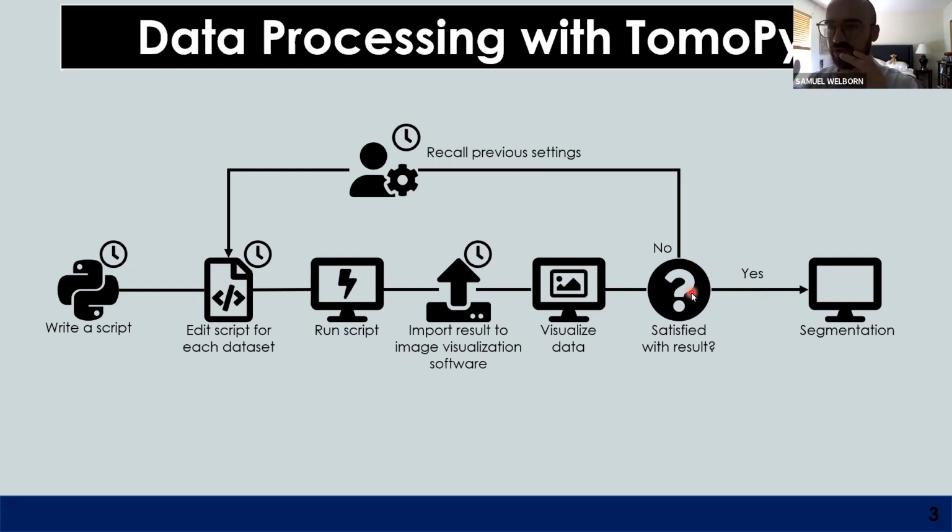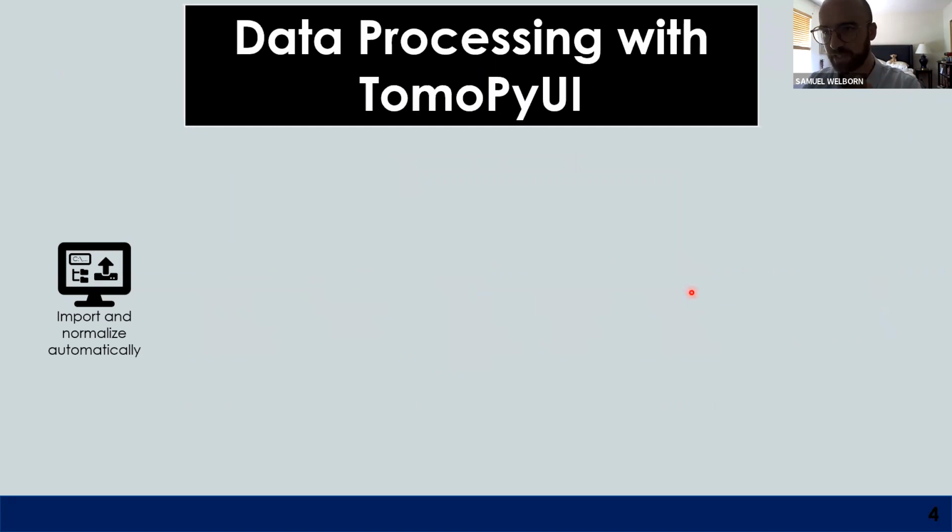For the average user of tomography, they come in and they have to learn this new Python API to figure out which of these variables are going to impact the final reconstruction. This is complicated for a user like me who doesn't really know anything about tomography data processing. So what I've built is TomoPyUI, just a user interface for TomoPy.